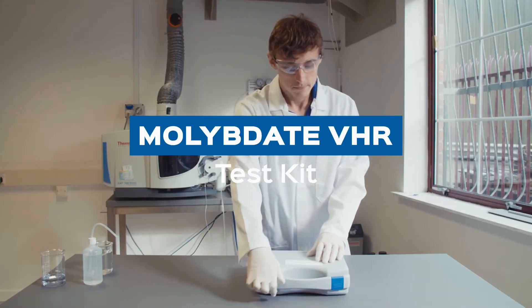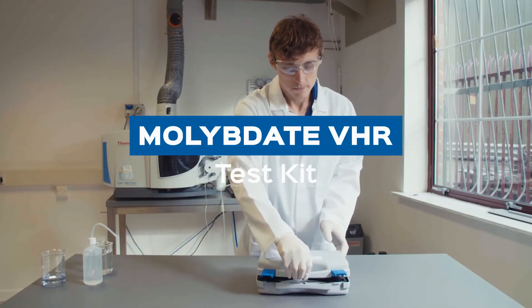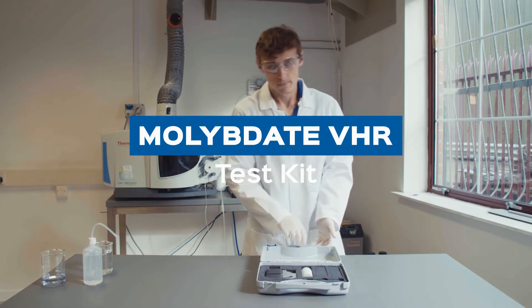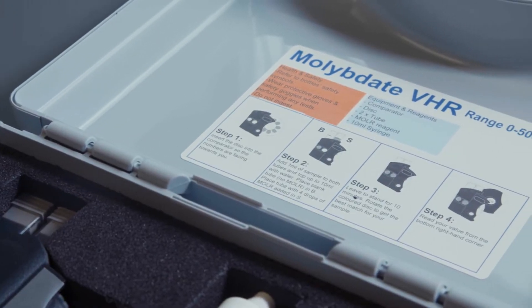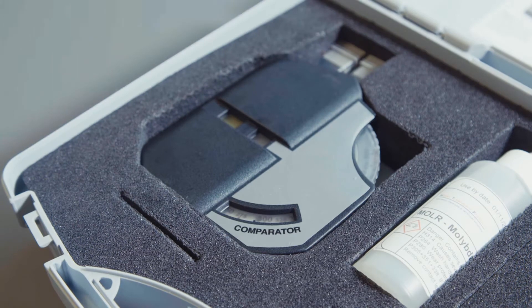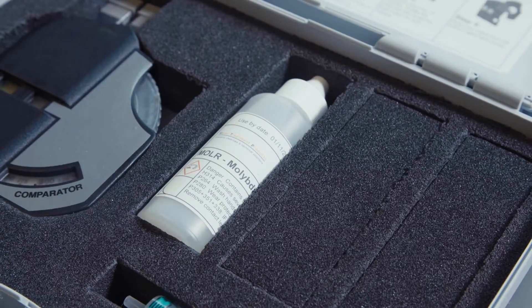This is an explanatory video for using the WTP Molybdate Very High Range Test Kit. The test kit contains all equipment and instructions necessary for undertaking a Molybdate test.